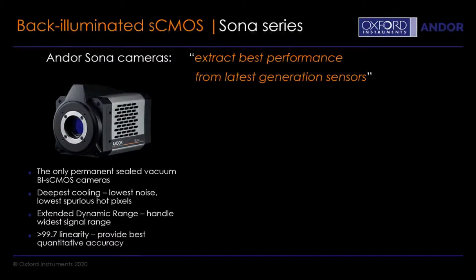And with these cameras, they have a higher dark current, so it's very important to suppress that dark current from being an issue with those cameras, and also importantly reducing the amount of spurious hot pixels as well, and for the kinds of studies that have just been presented, we can see that it's very important to reduce any of these spurious events from affecting our data.